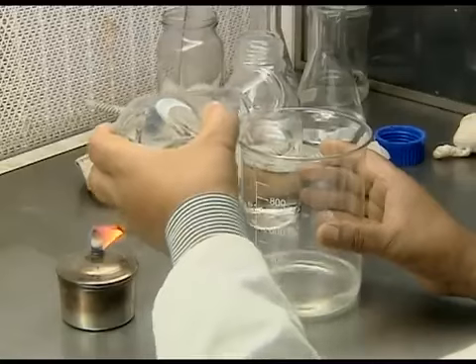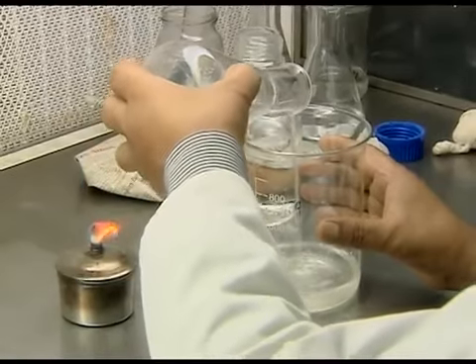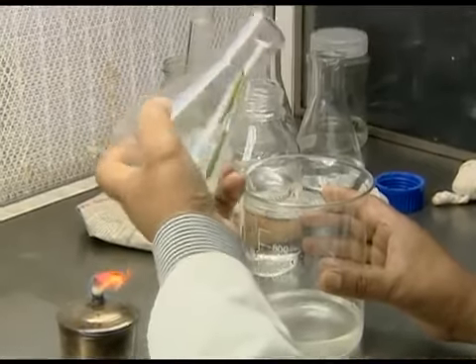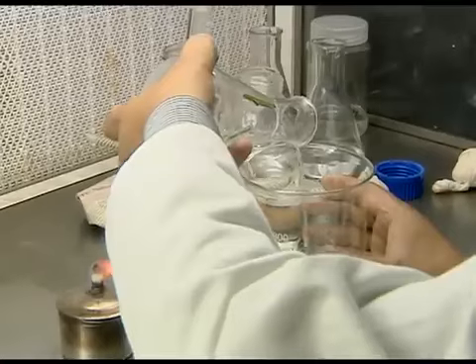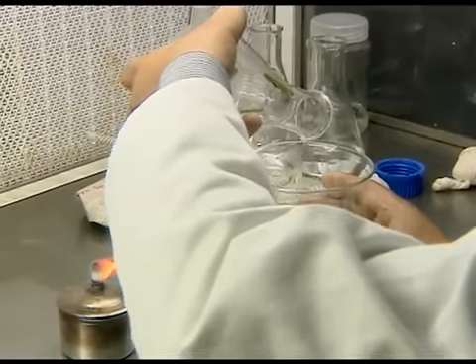After the sterilizing agent treatment, the solution is decanted into the waste beaker and the explants are washed several times with sterile deionized water to remove all traces of mercuric chloride.